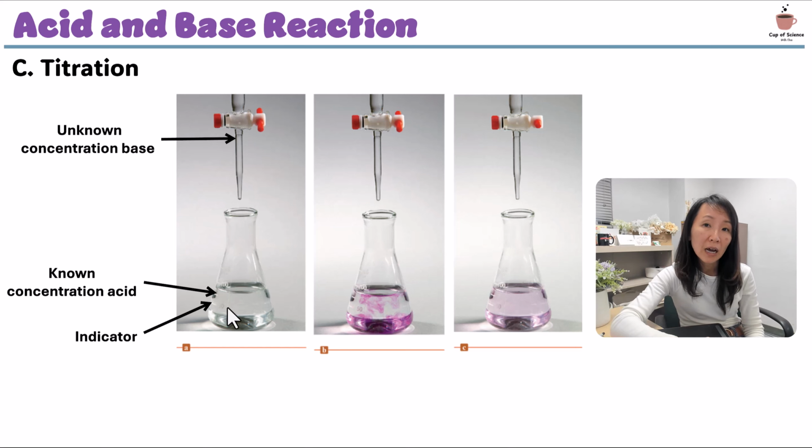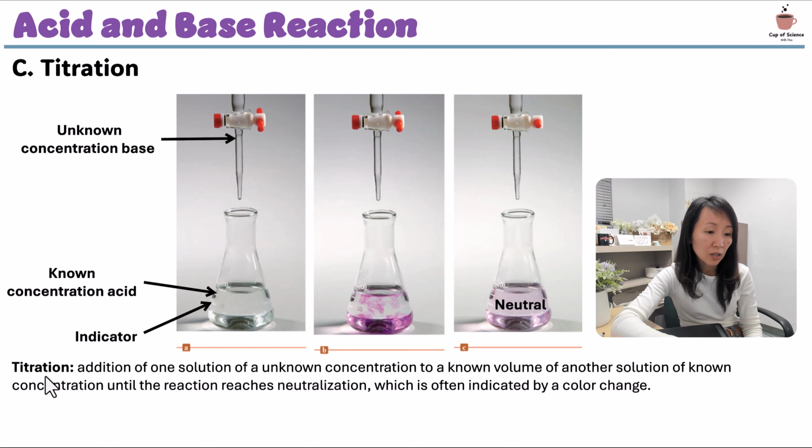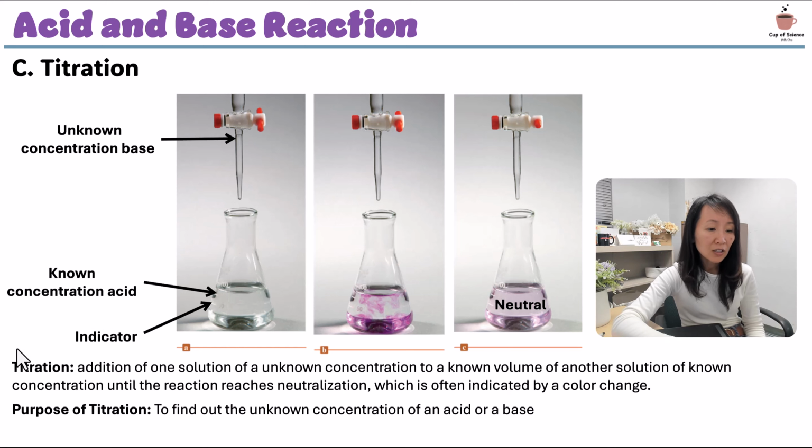Again, this whole experiment is called the titration. And the titration, by definition, is adding the unknown concentration substance to a known concentration substance, and you actually get to know how much volume of the unknown gets added in there. What is the whole purpose of doing this? Just to get that neutral substance? Not exactly. The whole purpose is to find that unknown concentration.